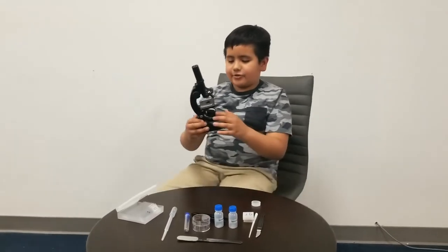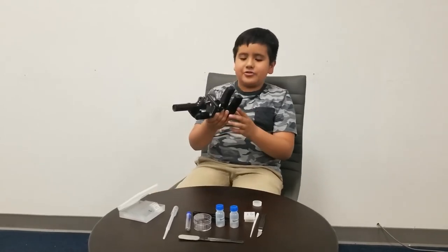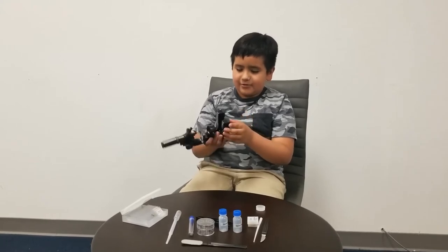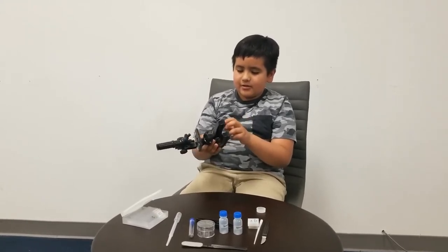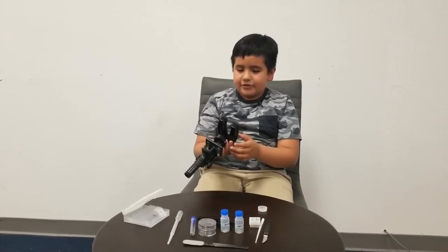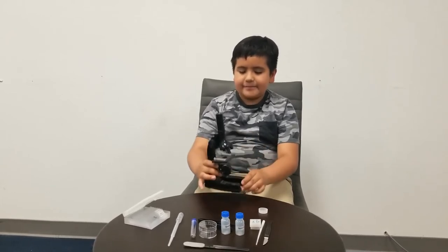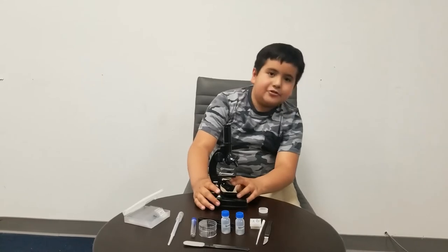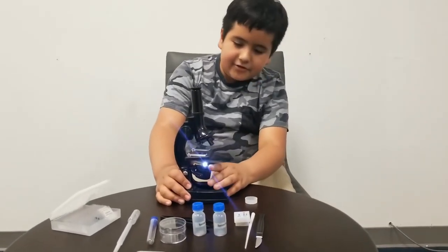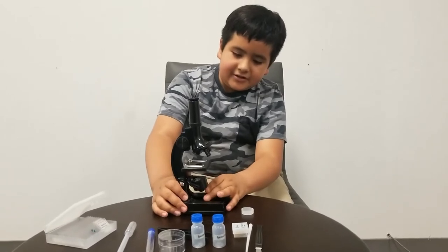Checking out this microscope. So if you want to install the batteries, which you probably will want to, you unscrew this and you put two AA batteries on each side. Then you can turn on the light — you can just flip it over right there — so you can put the slides under.